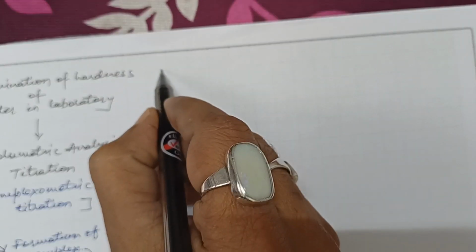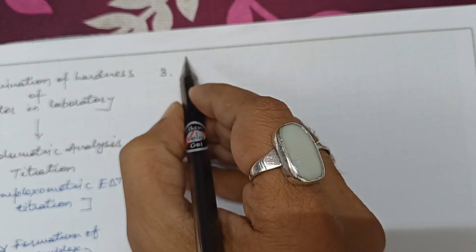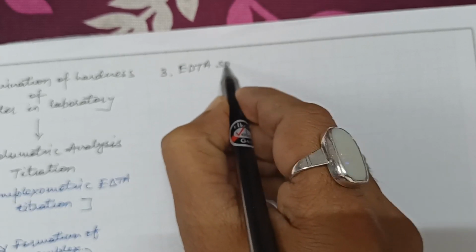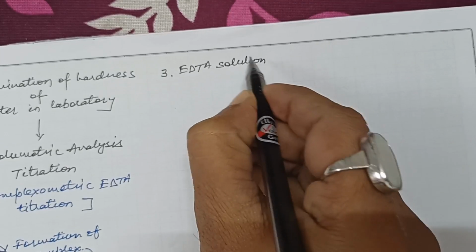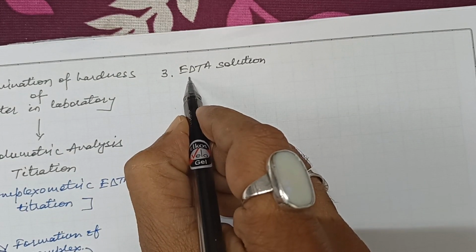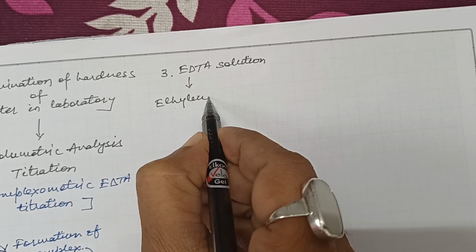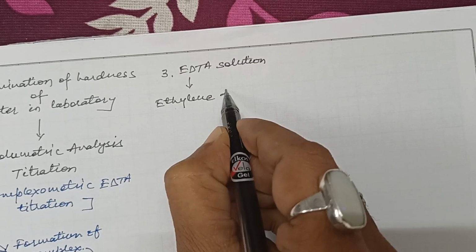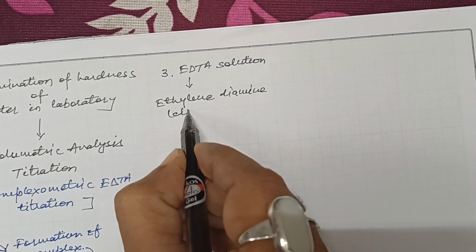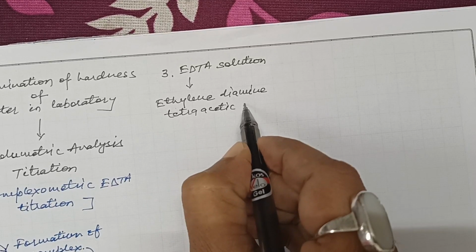The third chemical requirement is EDTA solution. The full form of EDTA is ethylene diamine tetraacetic acid.